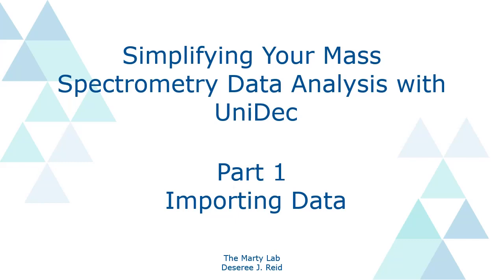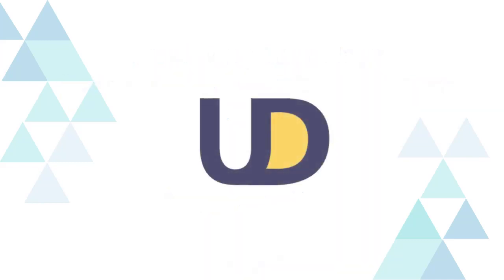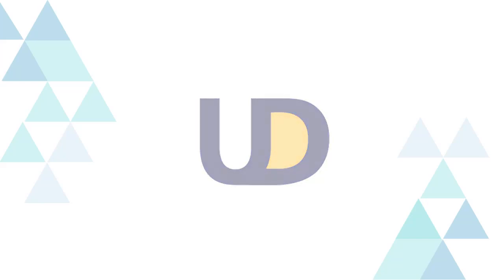Welcome to the MartyLabs series of tutorials on Unidec. Unidec is a free, fast, and versatile tool designed to help analyze electrospray and ion mobility mass spectrometry data.